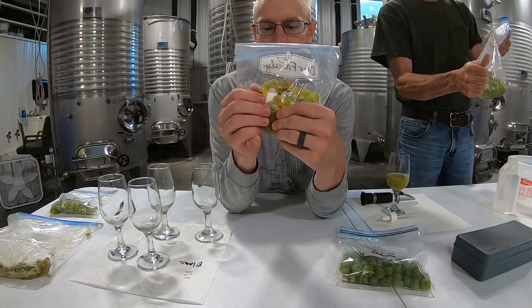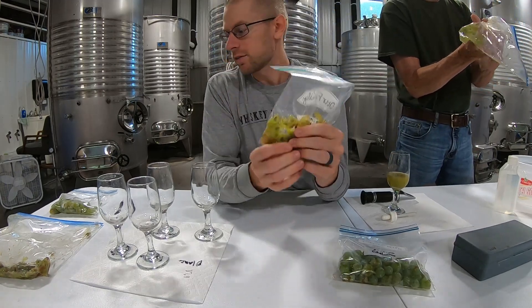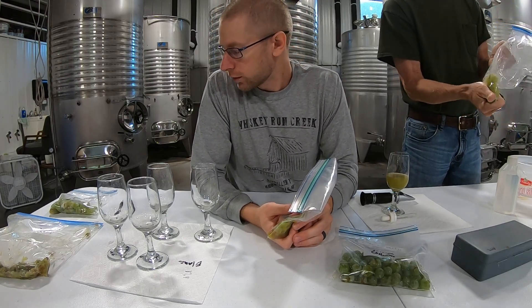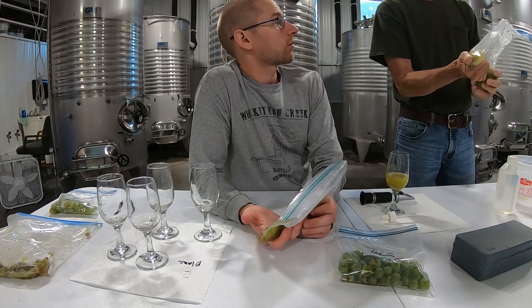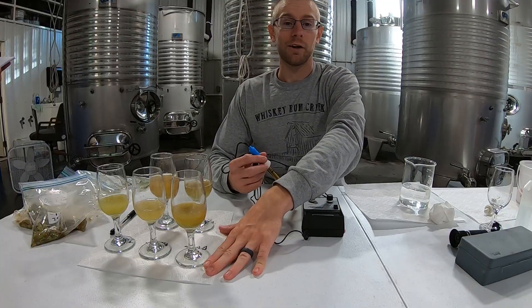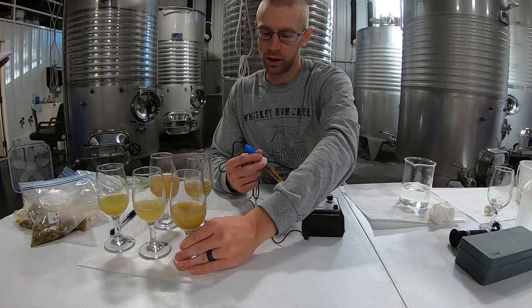Then you squeeze the juice out into one of the glasses, and that is how you do your Brix test. We've got all of our Brix tests done and everything written down on paper.